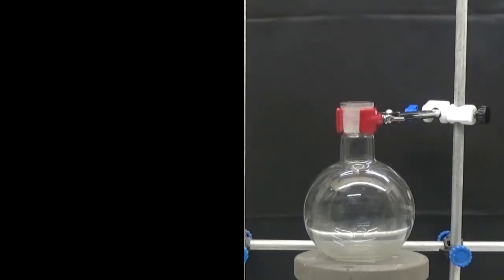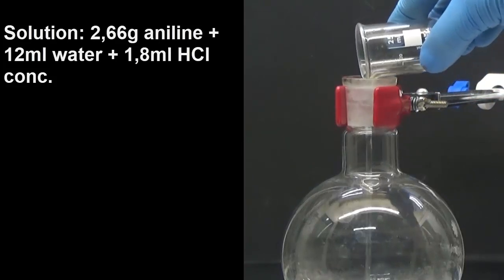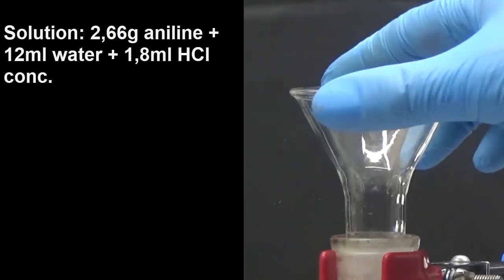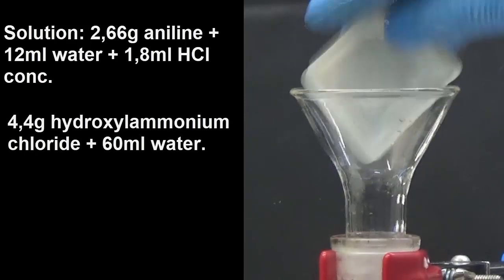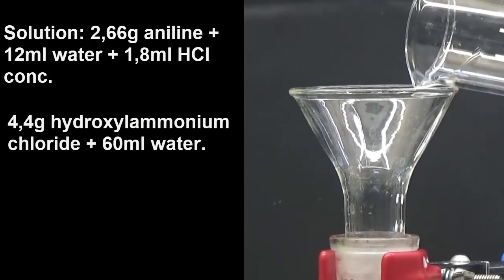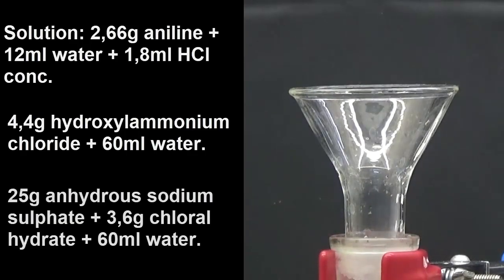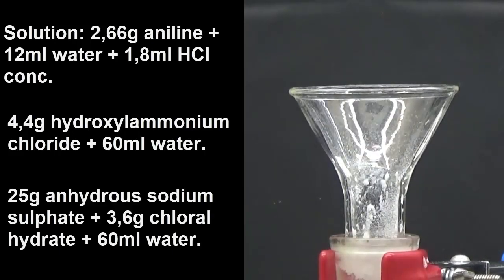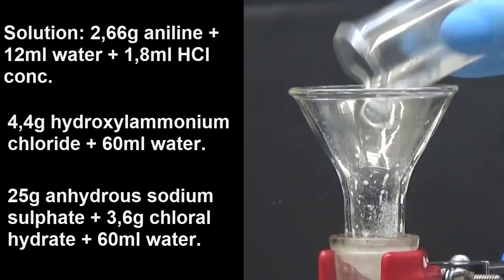To obtain isonitrosoacetanilide, blend into a 500 ml flask a solution of 2.66 g of aniline in 12 ml of water and 1.8 ml of hydrochloric acid. Using a solid funnel, add 4.4 g of hydroxylamine hydrochloride and 60 ml of water, 25 g of anhydrous sodium sulfate, 3.6 g of chloral hydrate and 60 ml of water.